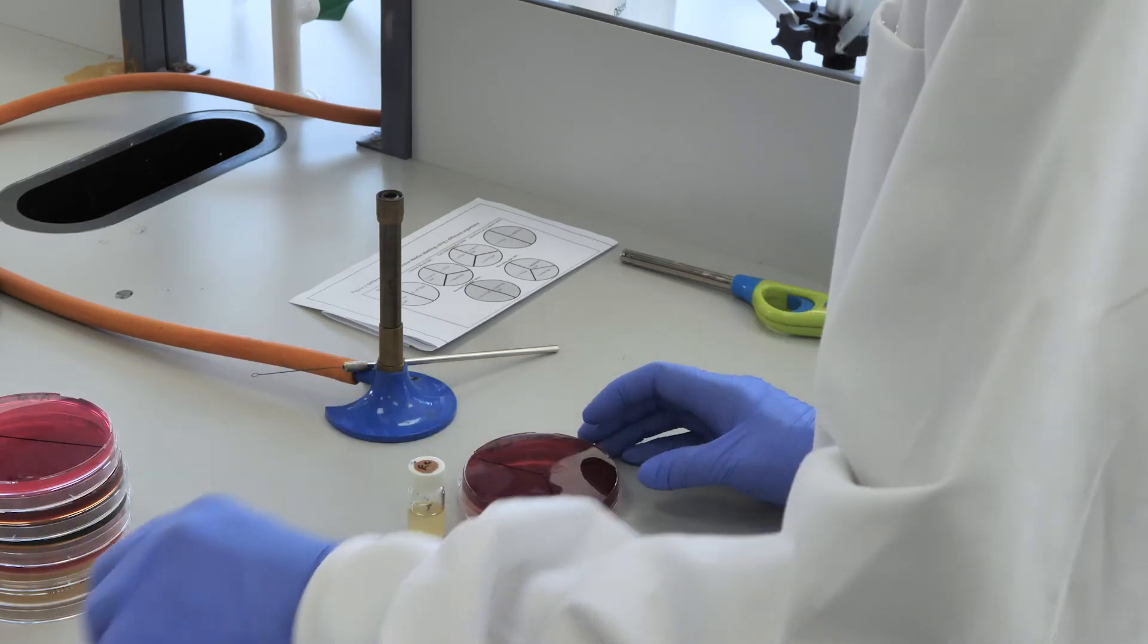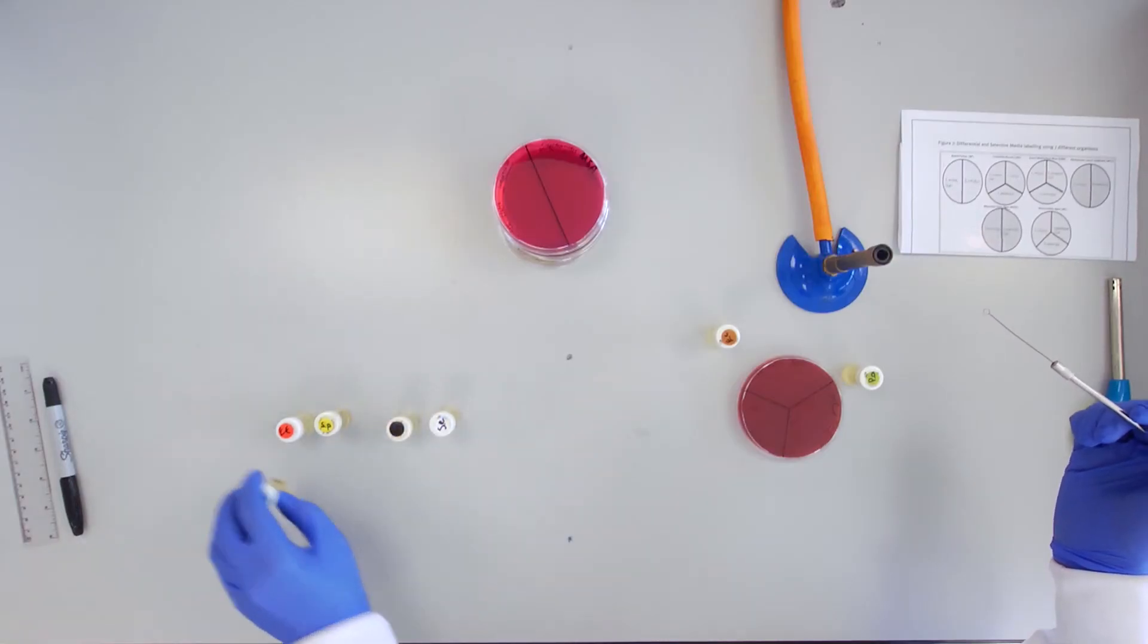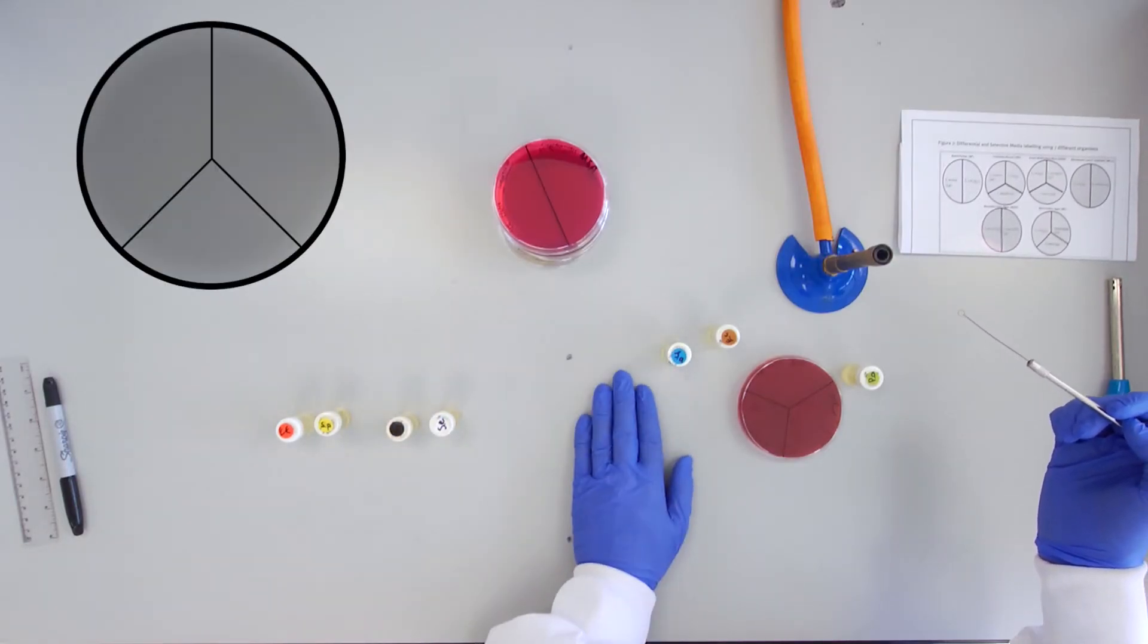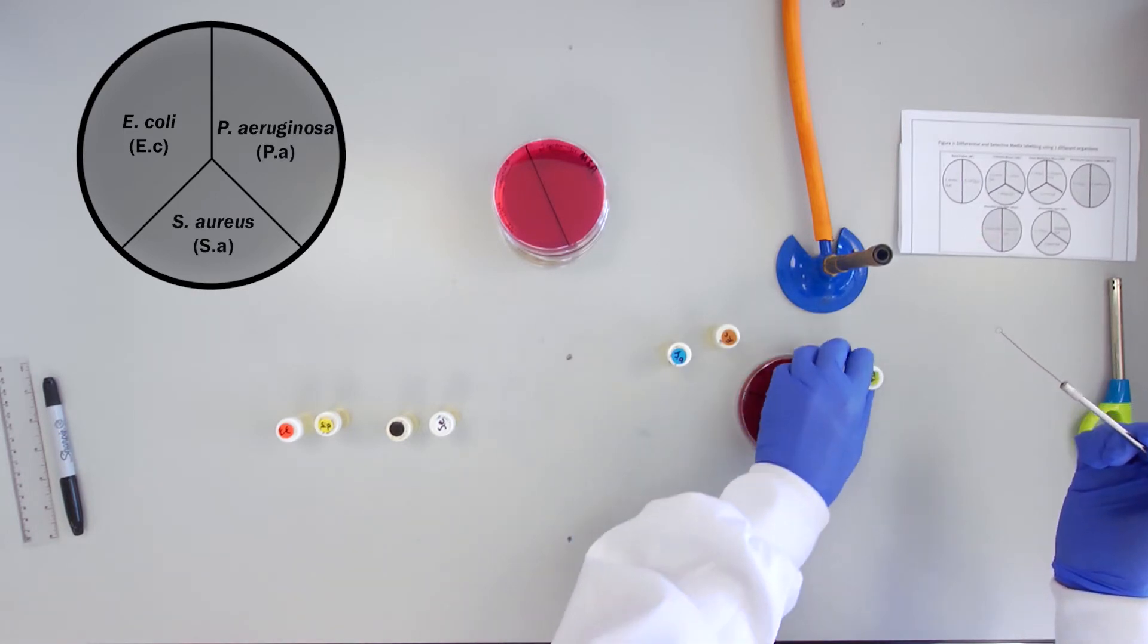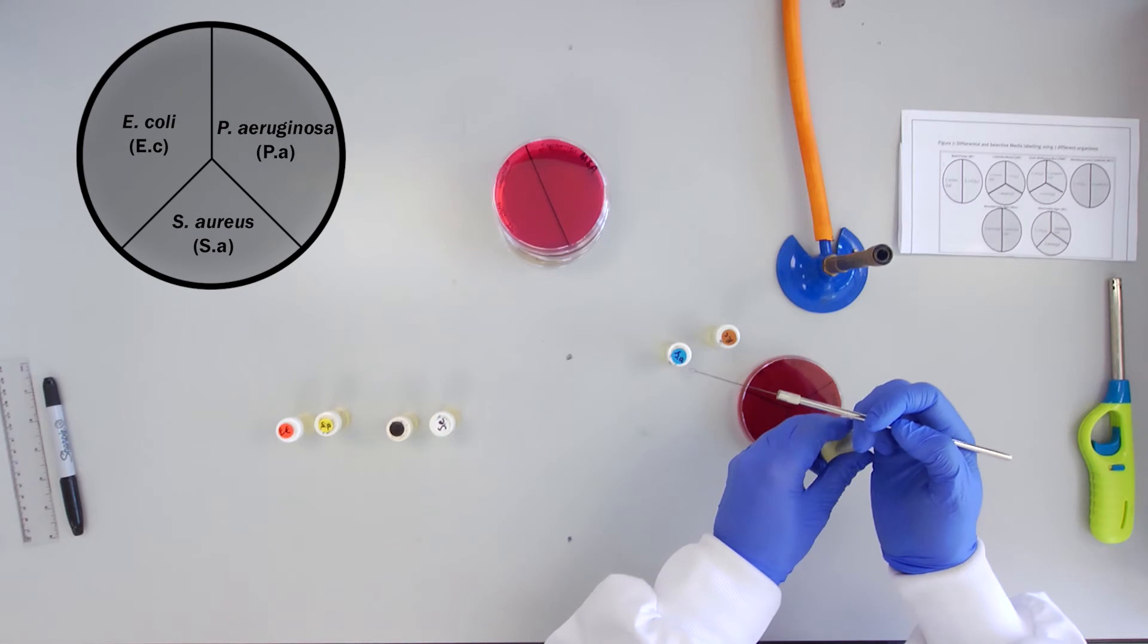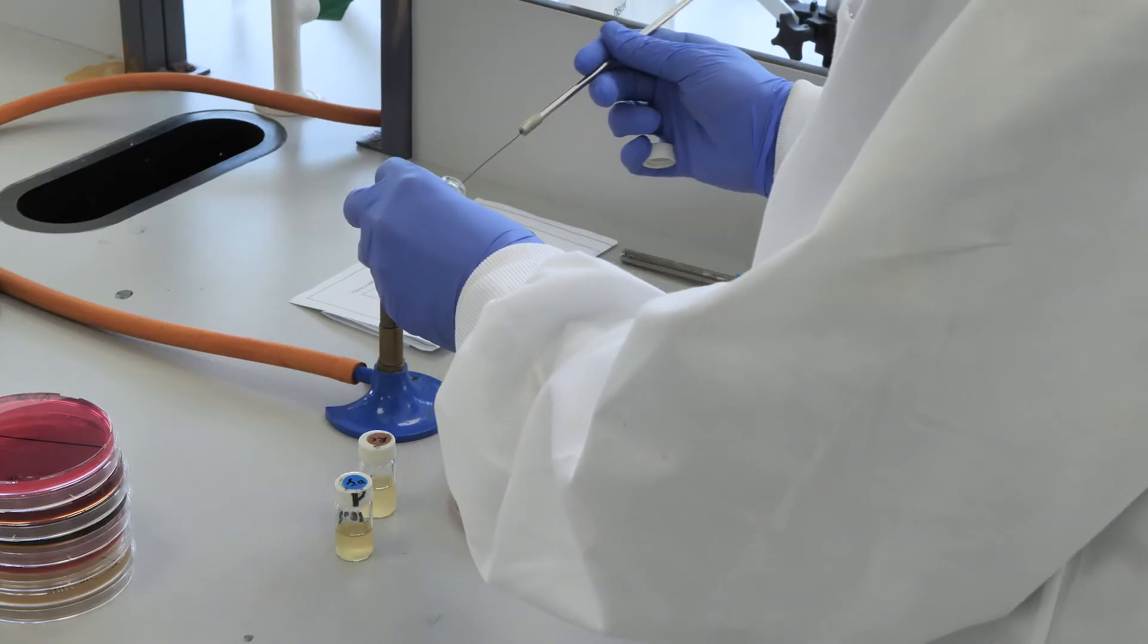The McConkey agar or MC is a deep red burgundy color and will be inoculated with E. coli, Pseudomonas aeruginosa, and Staphylococcus aureus.